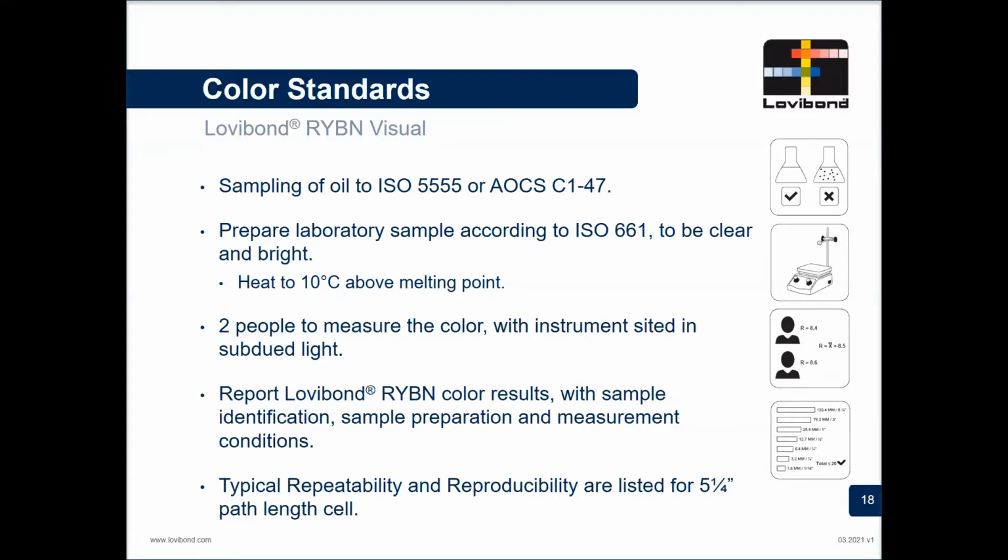Generally, it needs to be clear and bright, so we need to filter it, and we should heat it to 10 degrees above its melting point. In this way, we can be sure that we're looking through an absolutely clear sample.